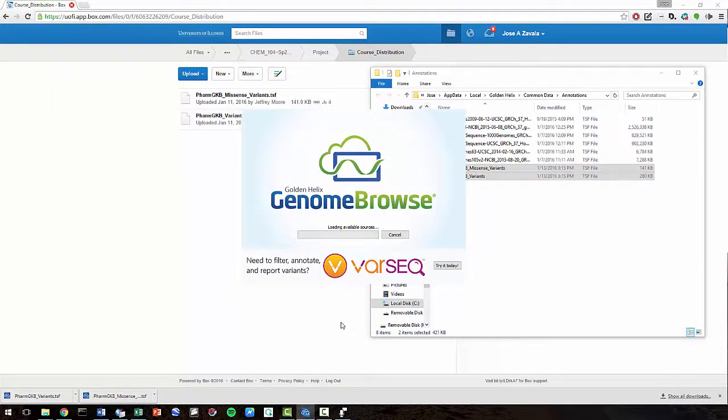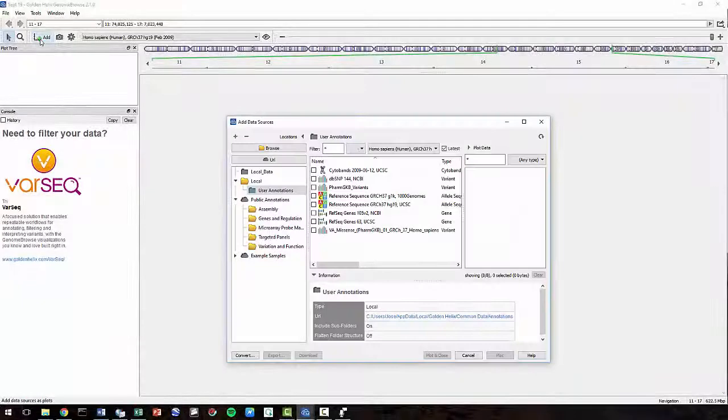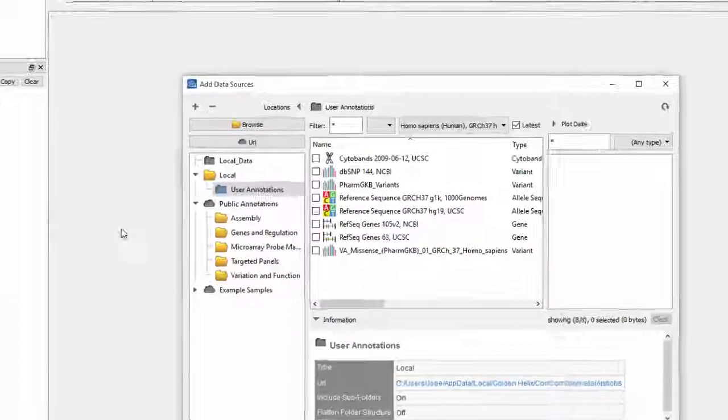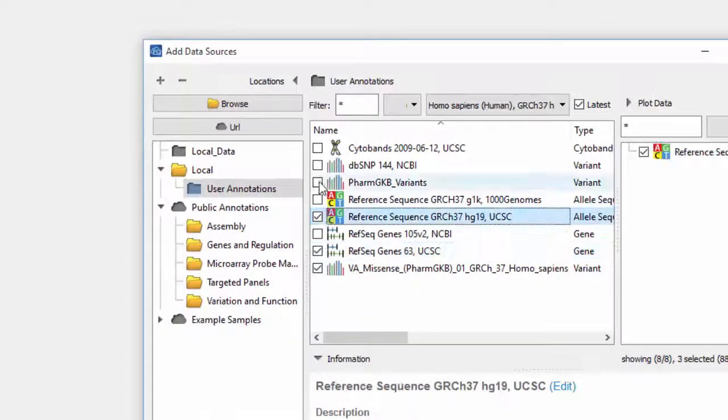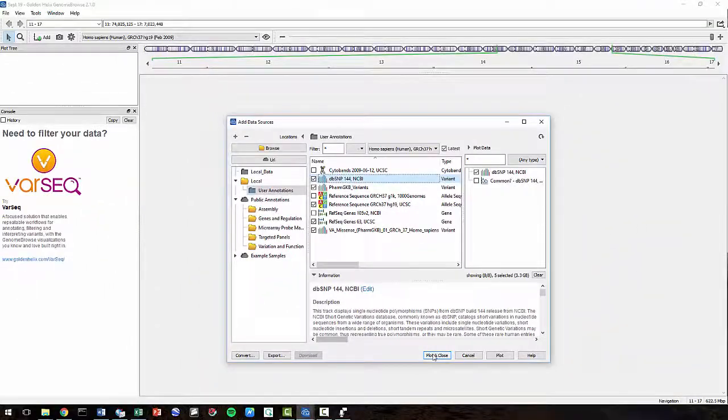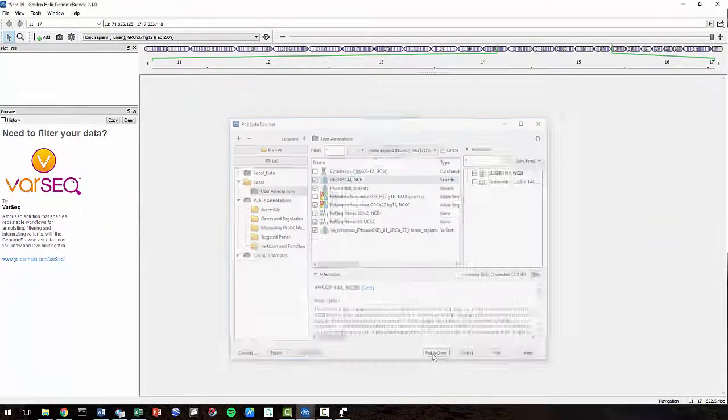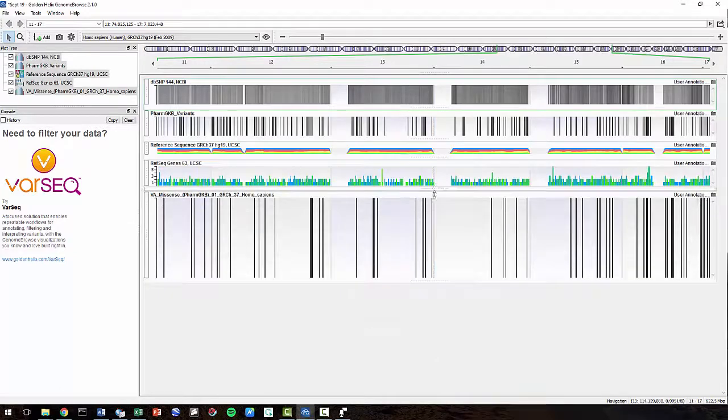Now let's go back to Add. And you'll see the two PharmGKB files have been added. So let's go ahead and make sure these new files we downloaded are working. Select Plot and Close. And you'll see that they do show up.